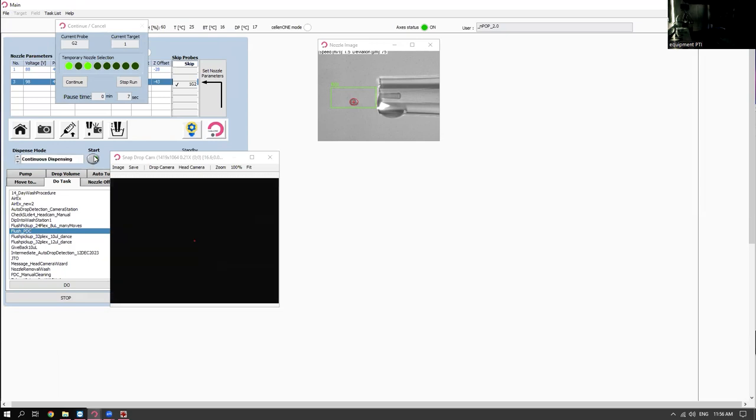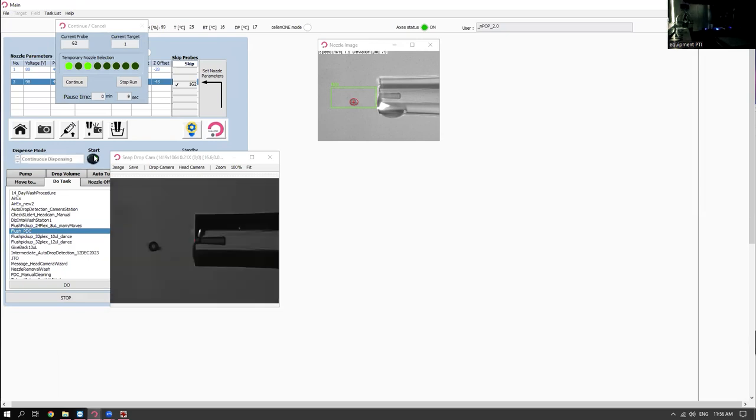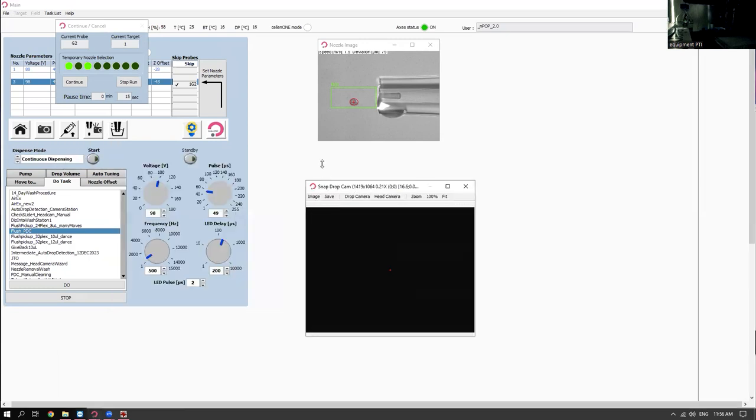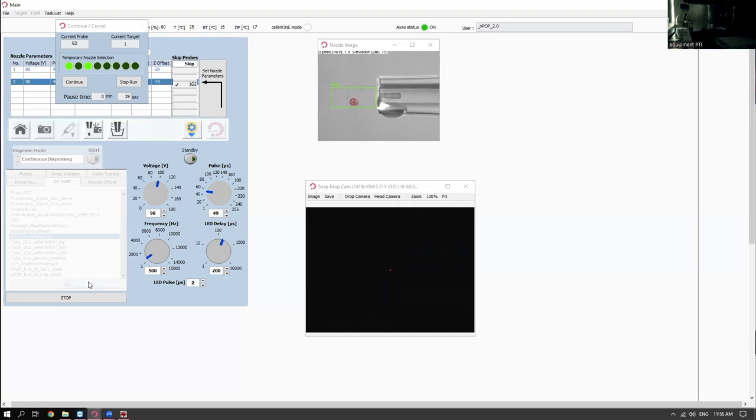I'm saying the test filling is being affected by my droplets. And so what I'm going to do, once we do this, maybe this PDC manual cleaning step. So we're going to wash this sample out.